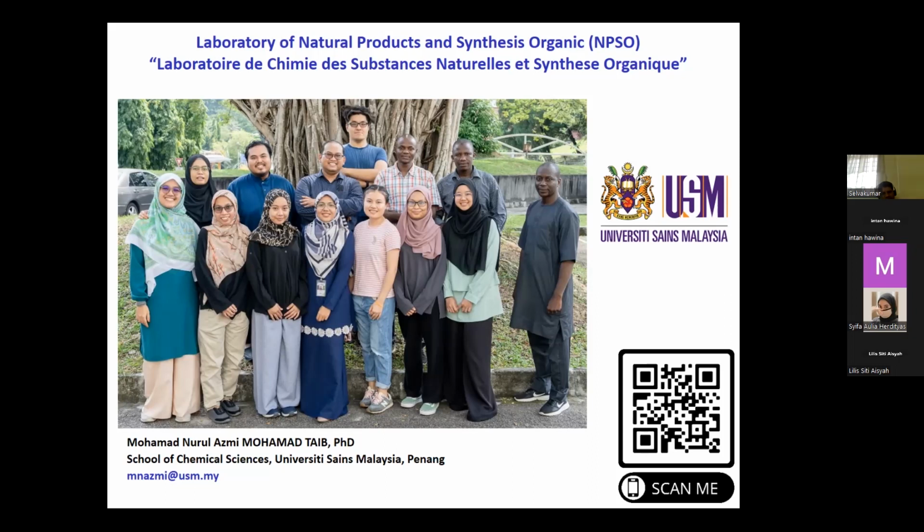Dr. Azmi, excuse me. Just now you said the purity of a sample affects NMR measurement. How do you know the purity of a sample? Because I see your explanation is detailed and clear, but my student has a spectrum that is not as clear as yours. Would you explain to me, please, Dr. Azmi?